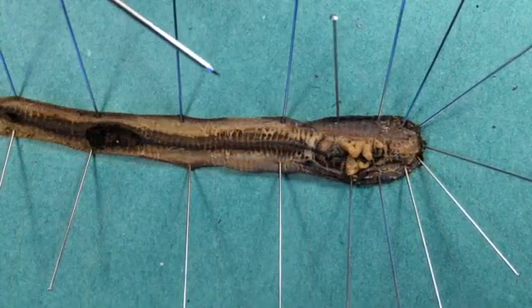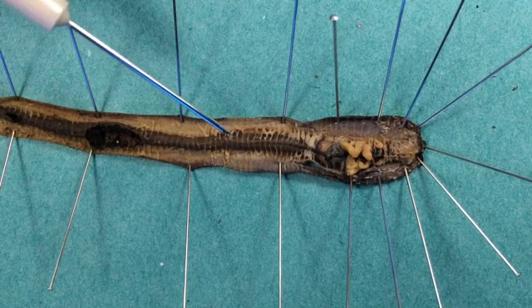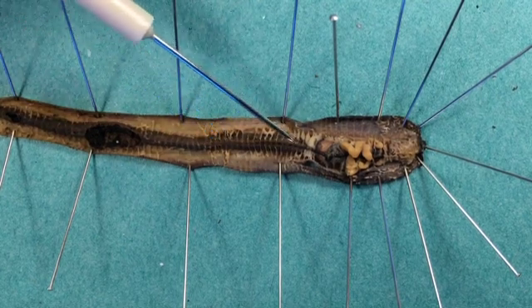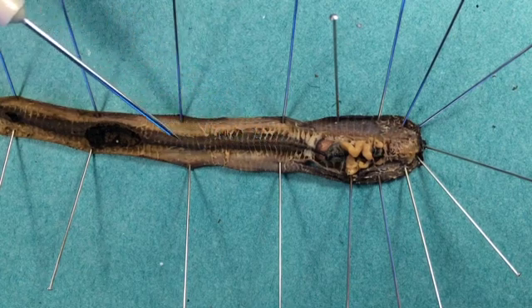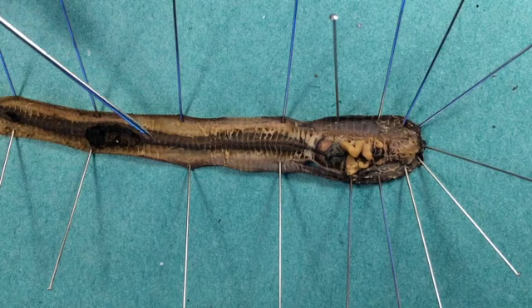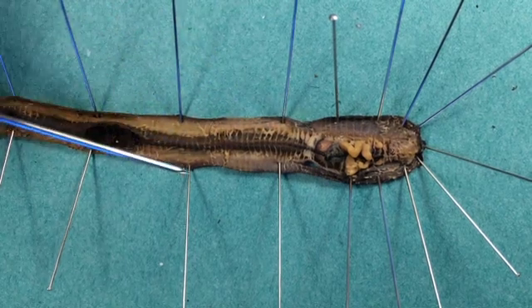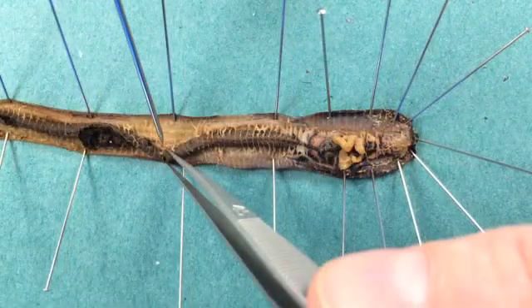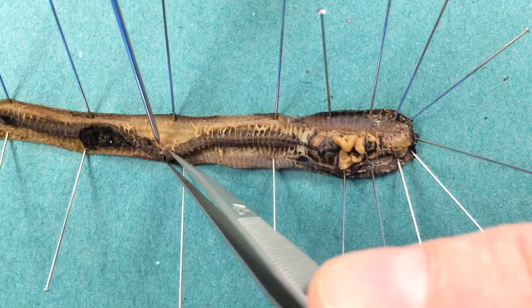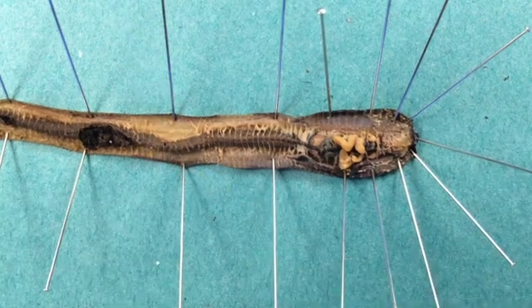Let's look at the circulatory system. Earthworms have a closed circulatory system — blood circulates in vessels. We can see the dorsal vessel running along the dorsal surface of the digestive tract all the way down to the end; this carries blood forwards. If we roll the digestive tract back, we can see the ventral vessel running with the nerve cord — that conveys blood backwards. So you have blood being conveyed forwards in the dorsal vessel and backwards in the ventral vessel.